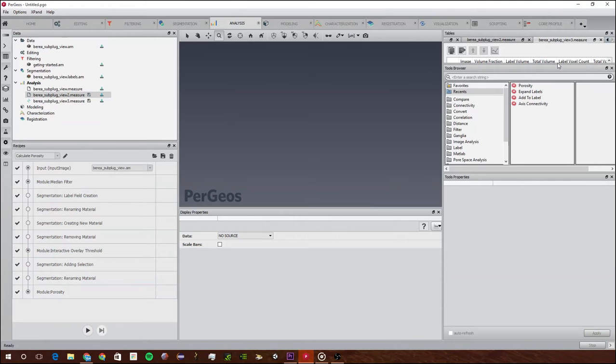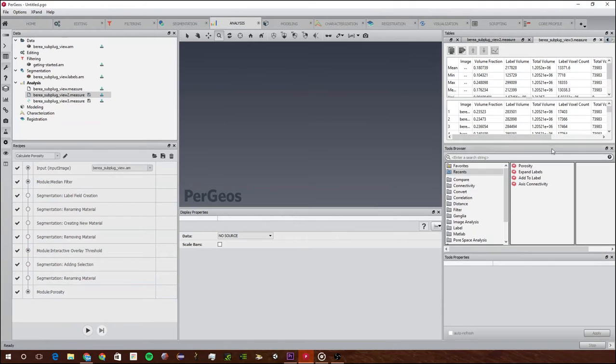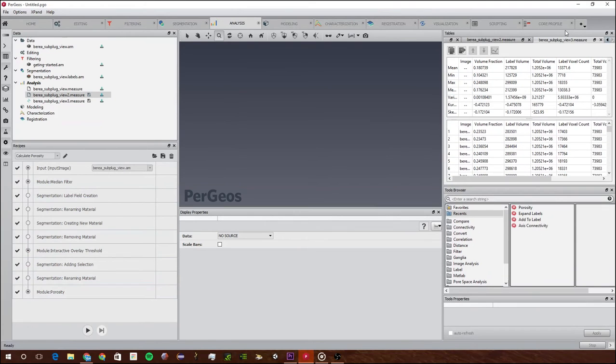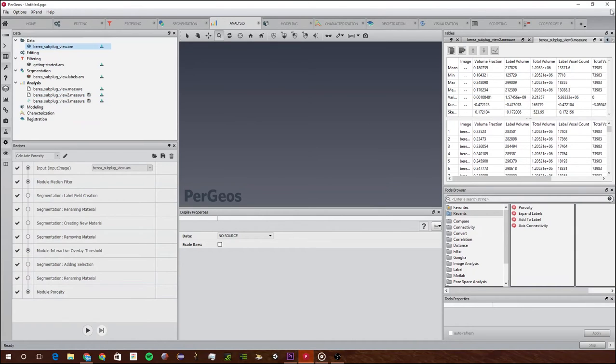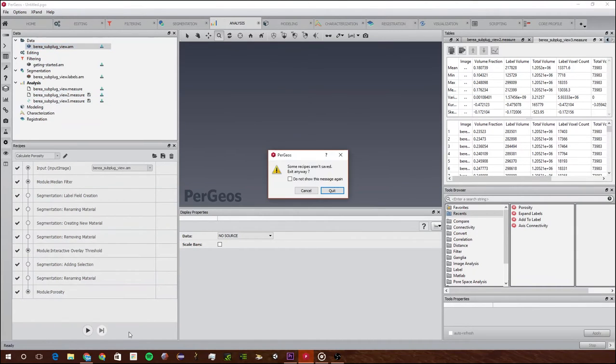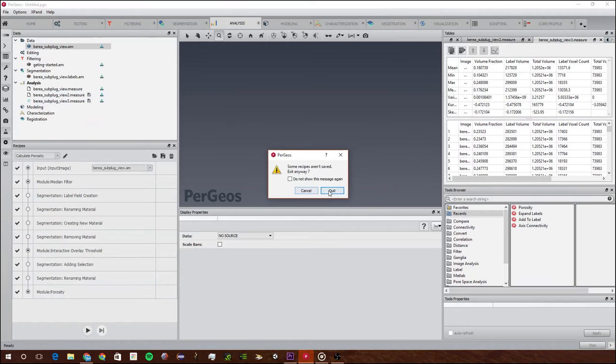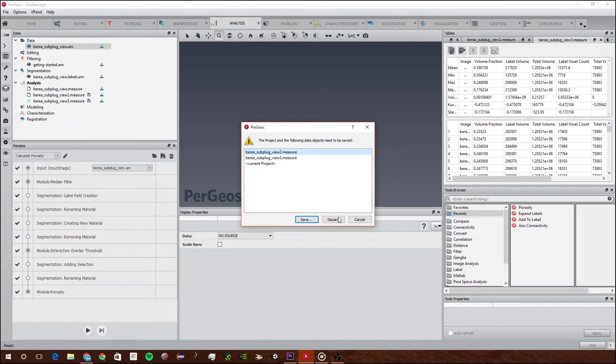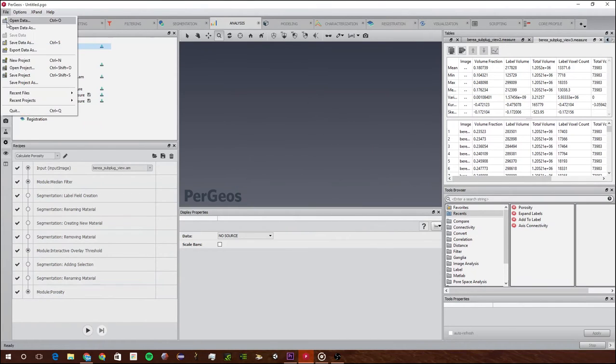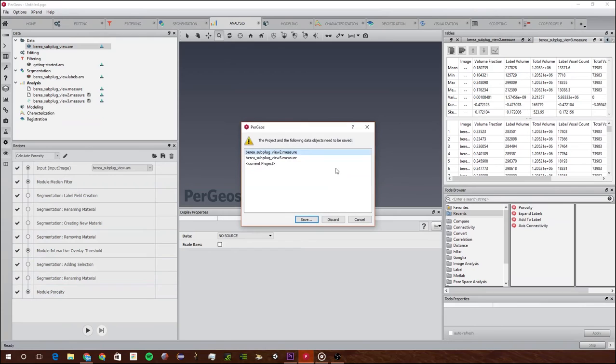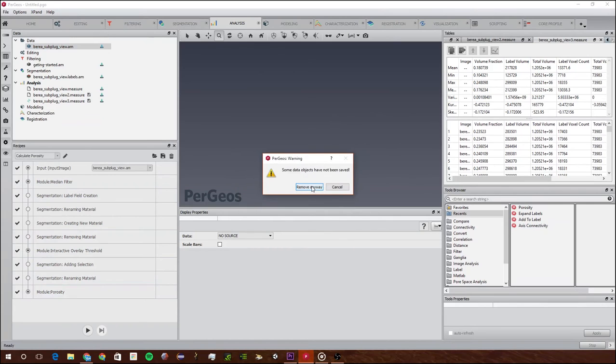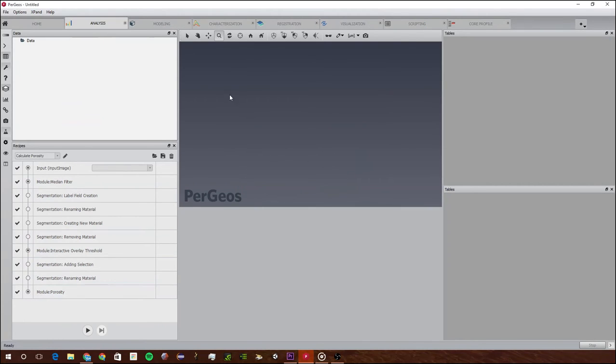It created just a new one, V3, Berea Slug Plug V3. Now I'm going to show you how to, I'm going to now close Pergeos and open it up again, or I'm just going to create a new Pergeos project. I'm just going to discard all of these.